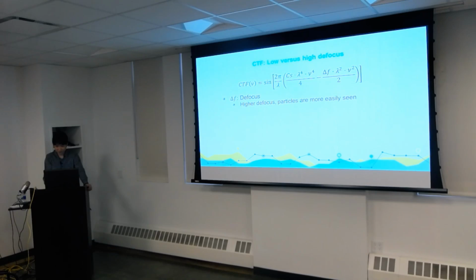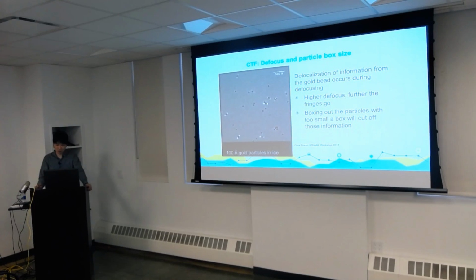Okay. The next concept to bring across with defocus values will be defocus and particle box size. What you see here is a slide from Chris Russo, in which these are actually gold beads imaged with cryo-TEM. And you can see all these little dots here. If you remember from Grant Jensen's lectures, these dots are actually like fringes of the gold beads as you put up the defocus.